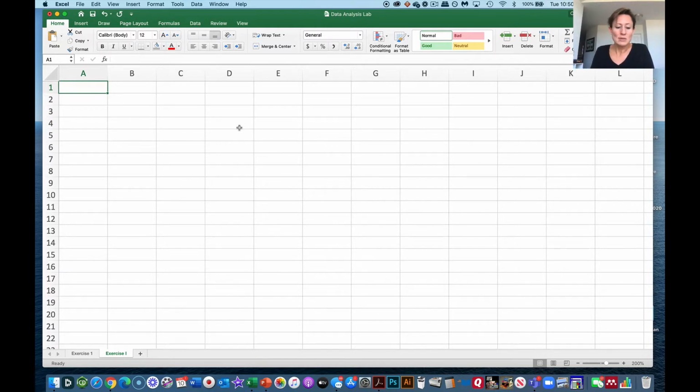So Bradford assay is a commonly used biochemical method that can allow us to determine the amount of total protein in a sample. And what we do is we base it on comparison of absorbance values to a series of protein samples that we prepare by serial dilution. So one of the things that we're going to create here is a couple of tables. And as I create these tables, I'll kind of reinforce this. Okay, we are using known concentrations of proteins to create these 8 samples that we then measure some absorbance values of. And then when we have unknowns, we can then use that absorbance data of the unknowns to figure out their concentration. So we'll walk through it as we do it here.